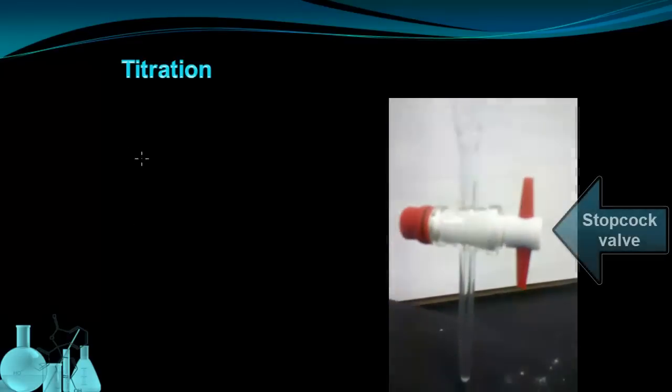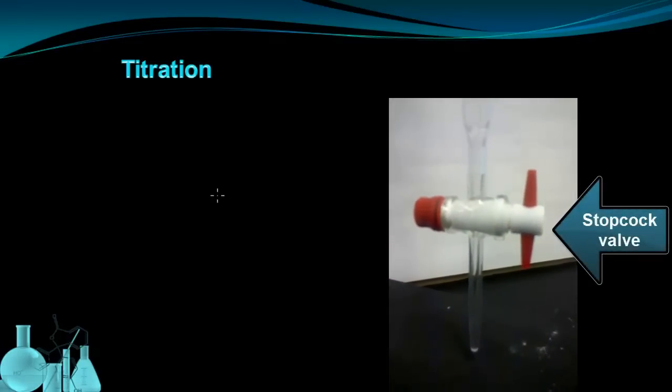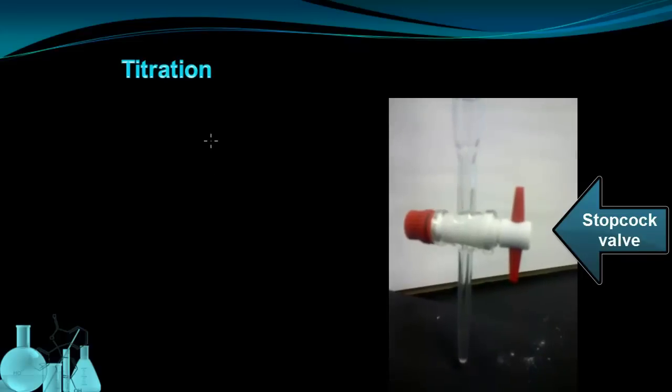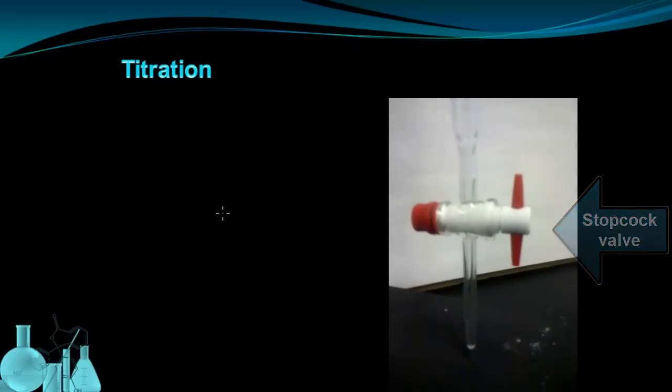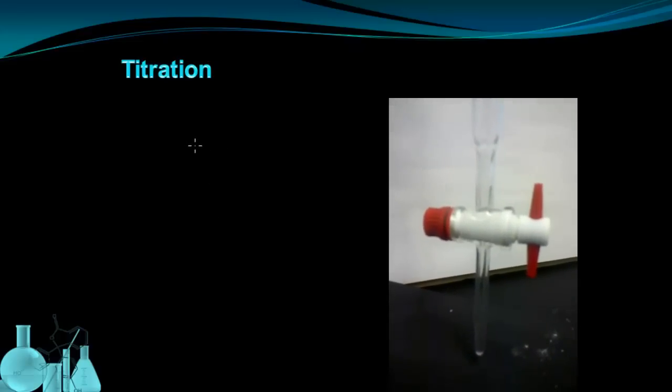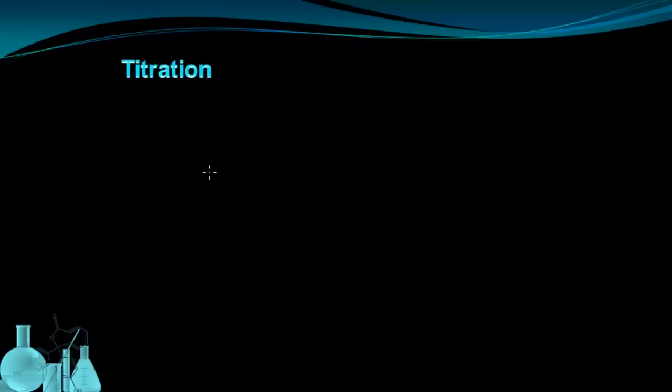And the burette ends with a valve called a stopcock and a small glass tip. It's important to note about the valve that when the valve is lined up vertically like it is here, so it's in line with the burette, it's open. To close it, you would turn it perpendicular to the burette, and you'll see that in the video.